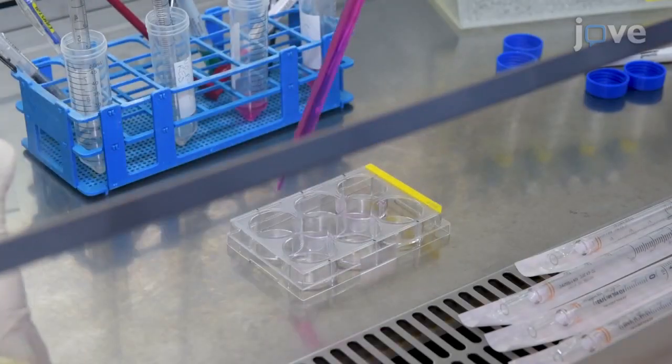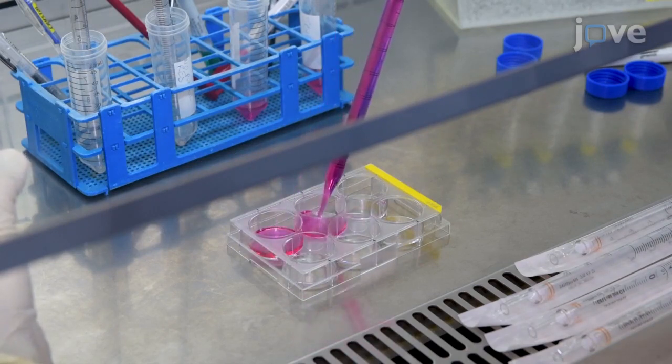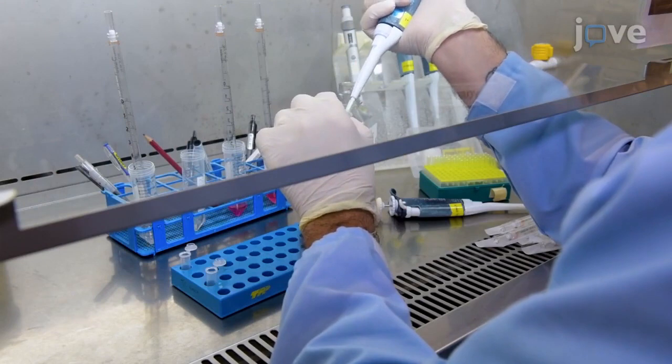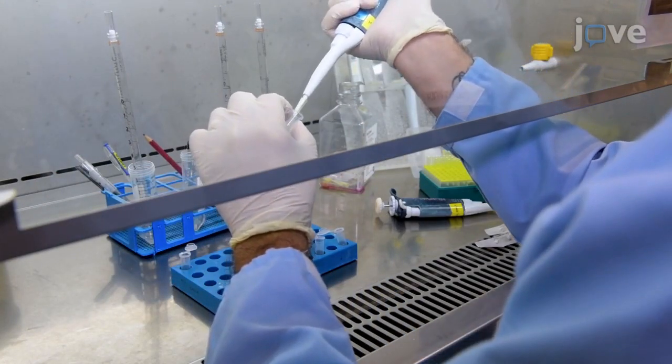Seeding the cells correctly and performing the transfection are the most challenging aspects of this protocol, since they may reflect directly on the expression of the PPI reporter system.